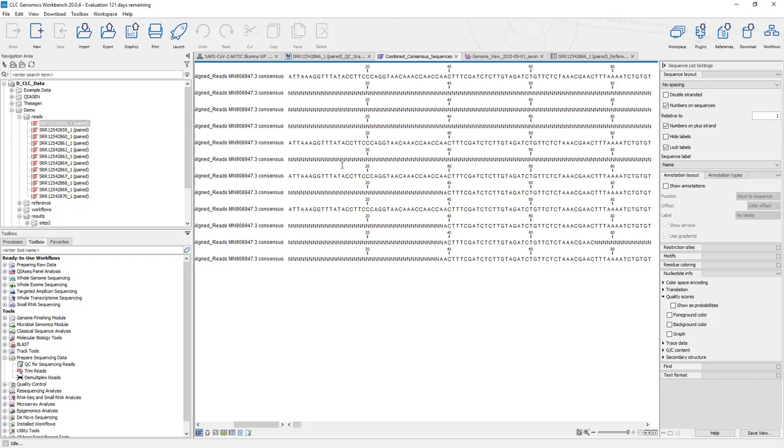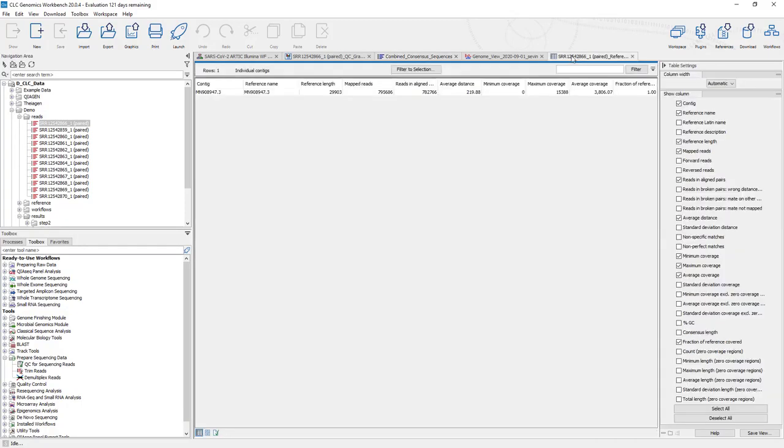And here you could see this is from some data that I've downloaded from the Sequence Read Archive for SARS-CoV-2. And we want to generate consensus sequences so that we can share these consensus sequences with repositories like GISAID or GenBank, so that public health scientists can perform surveillance and look at how the virus is moving around a population.